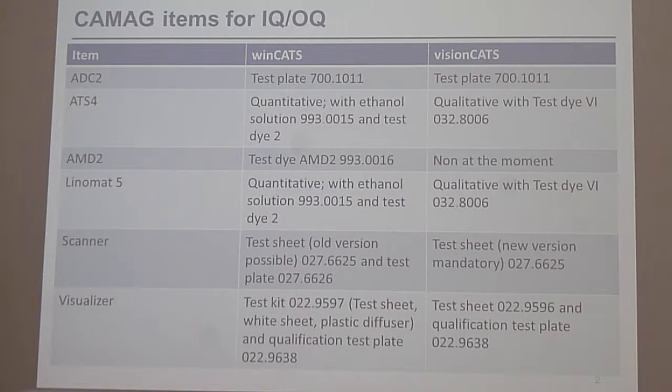Yeah. At the moment, although we use the quantitative and the ethanol solution, it doesn't actually matter what the exact concentration is, does it? Because for VisionCats with the ethanol solution, you're just applying the same thing, aren't you? Like 6 times, repeatability, isn't it? So it doesn't actually matter if you made it yourself, like you put 100 milligrams and made it. The actual amount doesn't matter because you're not saying, oh, this contains this compared to this. If you made a certain range, yes.